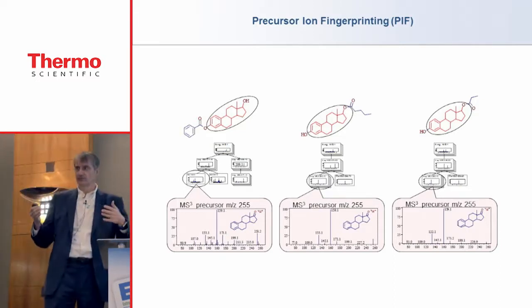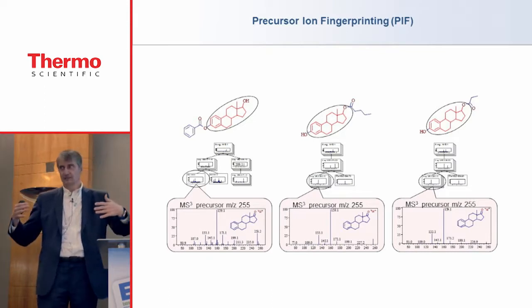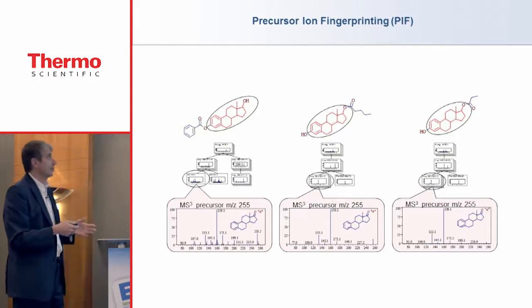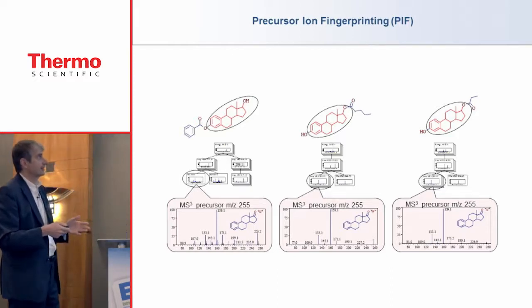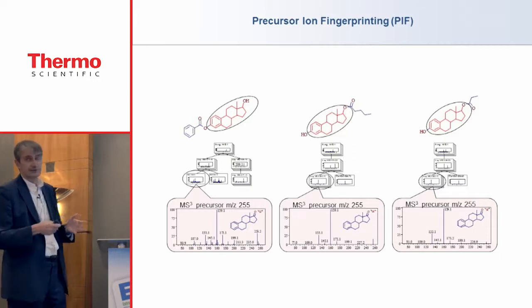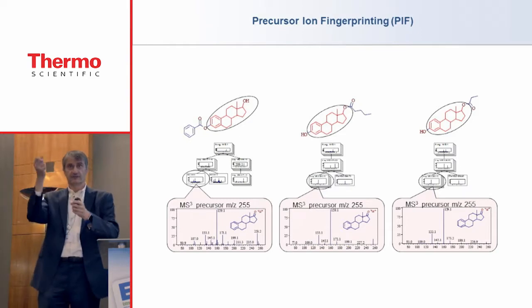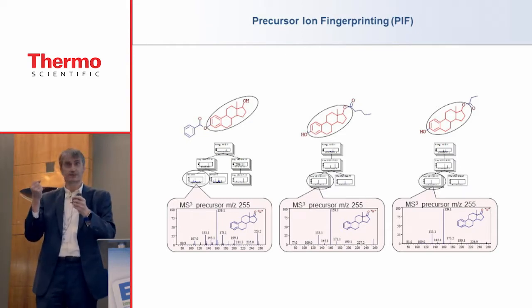This tries to identify substructures from unknown spectra based on analogies with other spectra. It is well known that identical fragments produce the same spectrum. Why is it? Because once we isolate a fragment, it doesn't remember where it is coming from, it doesn't remember its parent.